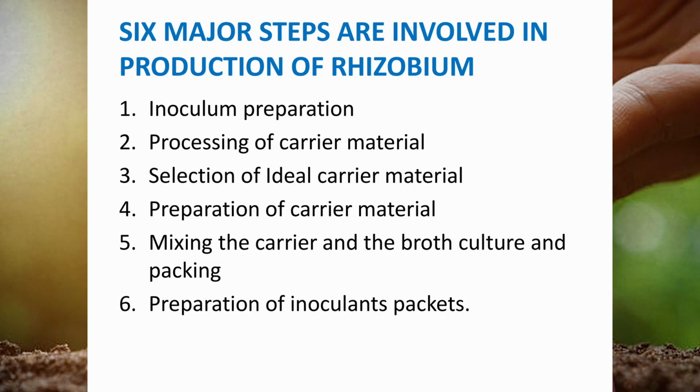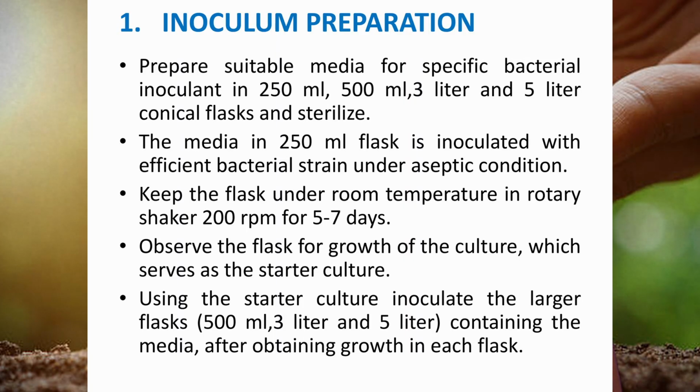And sixth one is preparation of inoculants packet. Okay, first we have to prepare inoculum. Now we are going to inoculum preparation.